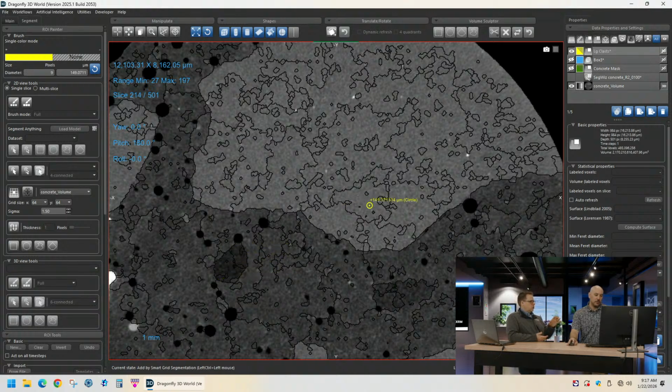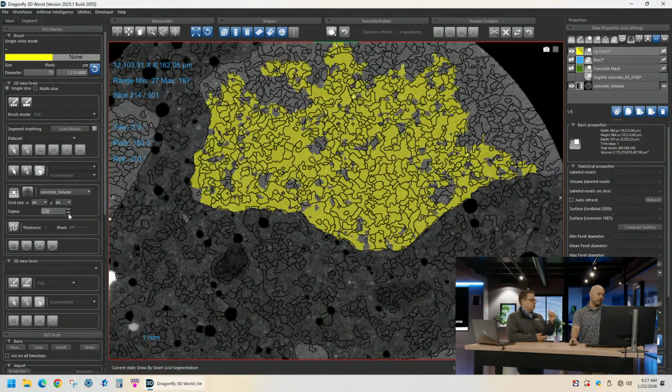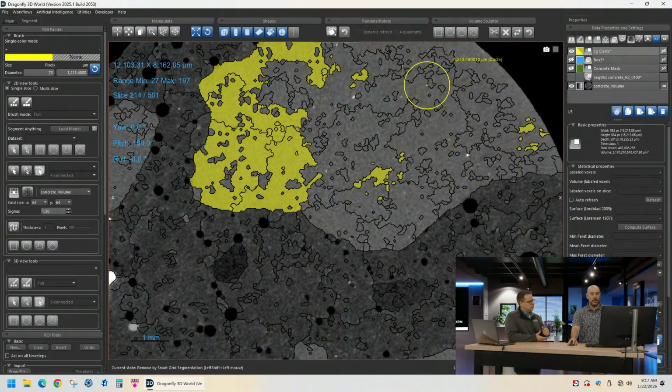So in there, you've got two things you can play with. You've got grid size, and that's going to change whether you're looking at very fine features or more macro features. And then you've got sigma, and that changes your sensitivity to the differentials. If you set it too far one way, it's going to be too sensitive to noise. Set it the other way, it's not going to pick up on subtle adjustments. So you've got to play with these things a little bit. And again, it's really amazing what you're doing.